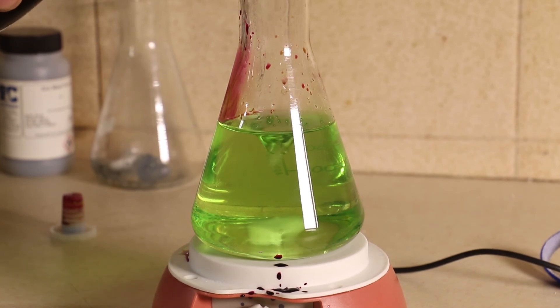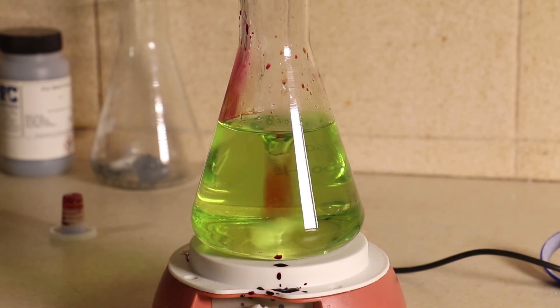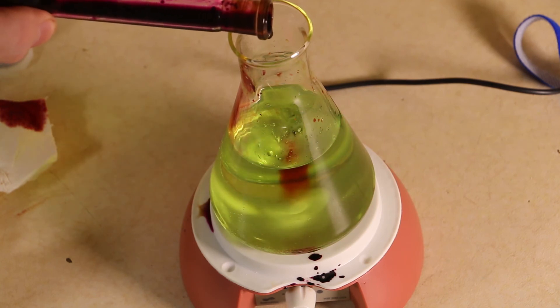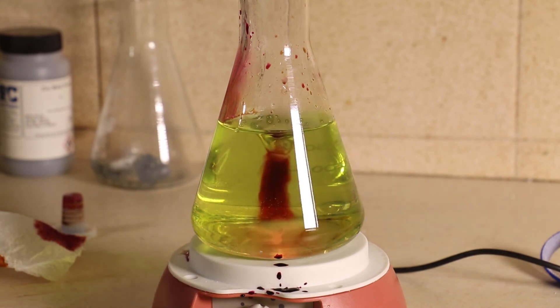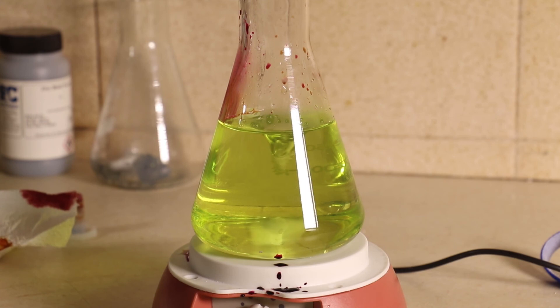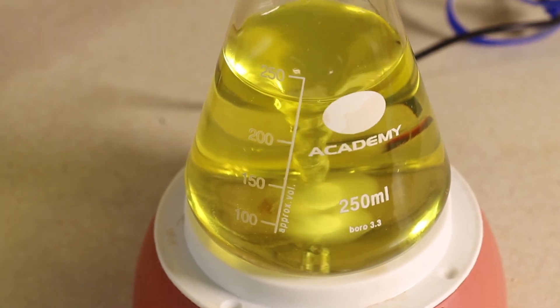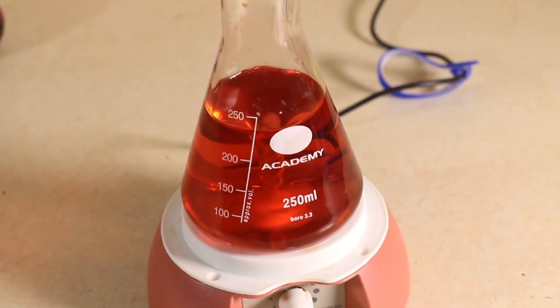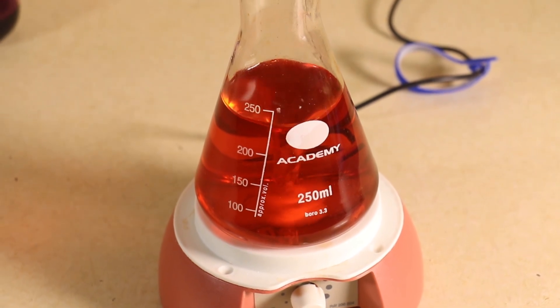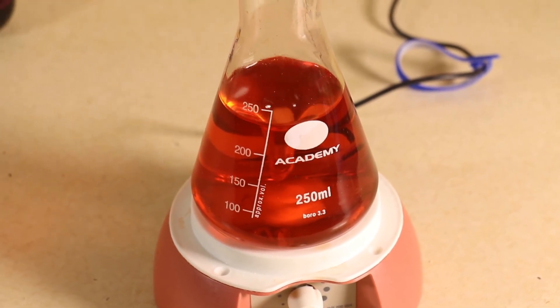We can just see the yellow solution of the vanadium 5-plus appearing with a couple more drops. And there we are — we've taken it back from vanadium 2-plus back to vanadium 5-plus. Adding another couple of drops, we then know we've gone over the end point, and we can see the colour of the excess potassium permanganate starting to appear, showing the vanadium is no longer changing it.